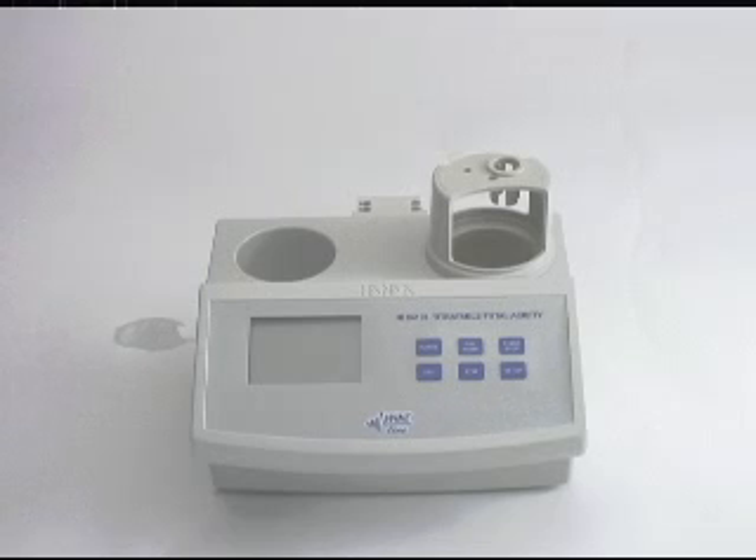Welcome to Hanna Instruments. Today we're going to be going over the setup, calibration, and testing with the HI84102 Total Acidity Titrator for wine.